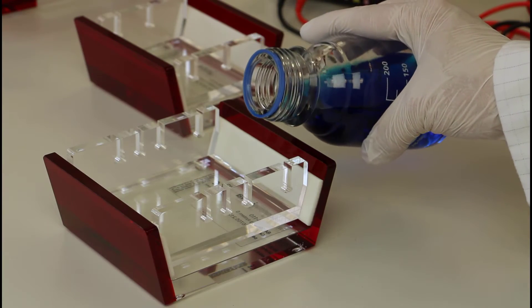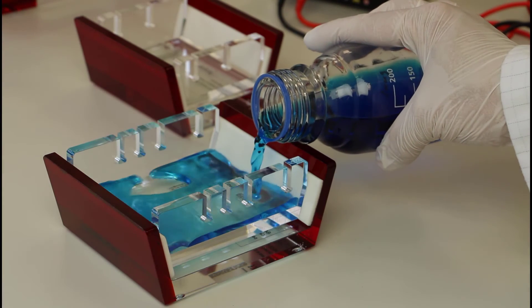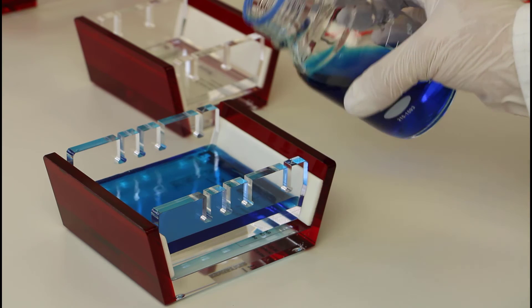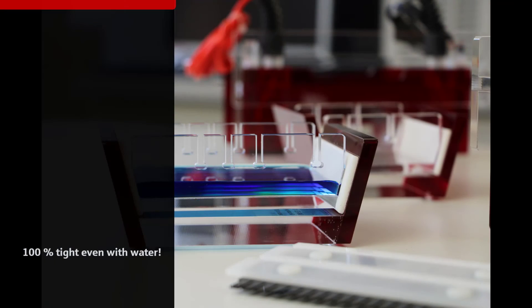Thanks to the special design of the pouring system, it is also possible to use low-concentrated agarose solution without any leakage. The water test proves it.